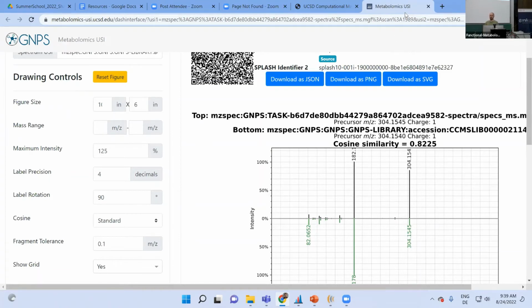So for me, working with very complex data where I also often have chimeric spectra, that means spectra that result from different precursors in the same isolation window, it is not beneficial to filter too much. So I get more hits when I turn this off.